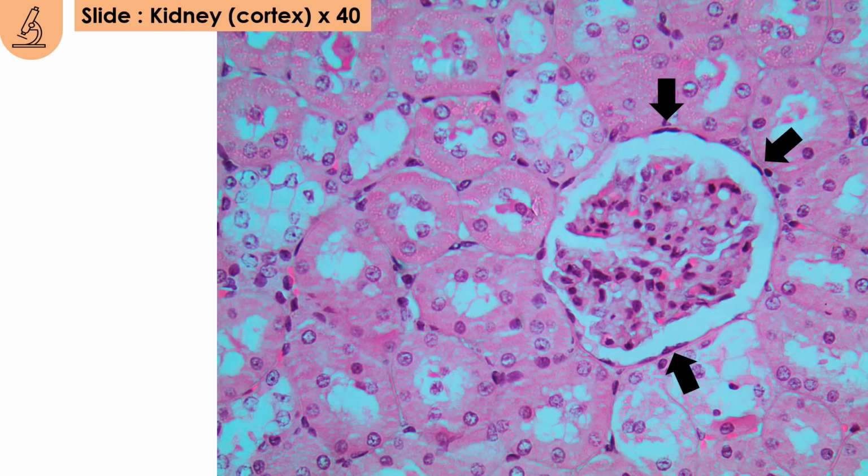This one is times 40. Just now it was times 5 only, under lower magnification, in the slide before this. This one is under higher magnification, times 40. So this is how the cortex of the kidney looks at times 40. Remember this structure I mentioned earlier? This is the glomerulus. These are the tubular structures I mentioned earlier, numerous of them. This is the large rounded structure that you could see under lower magnification just now, darker compared with the rest of it.